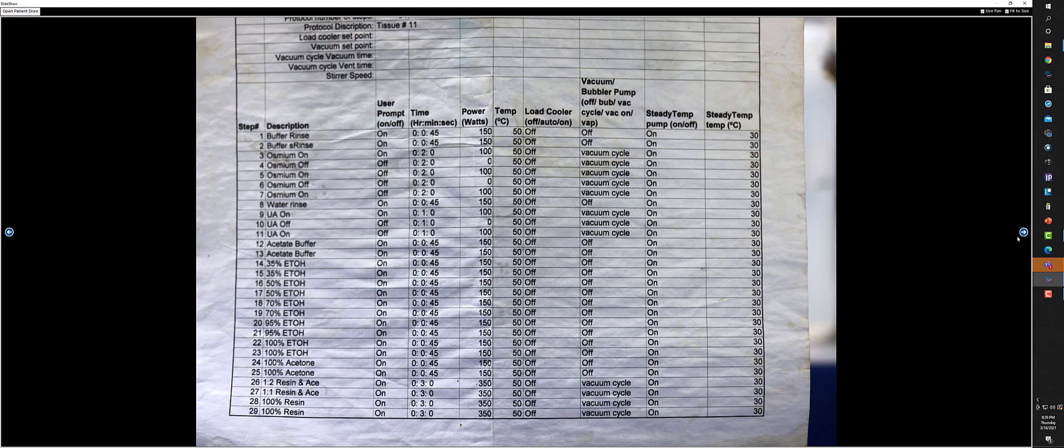And then it goes through a process, a 29-step process, to embed this specimen in resin. This takes about a day to do if you stick with it. Many of the steps are timed and have to be done in sequence, so you have to be there through the whole sequence.